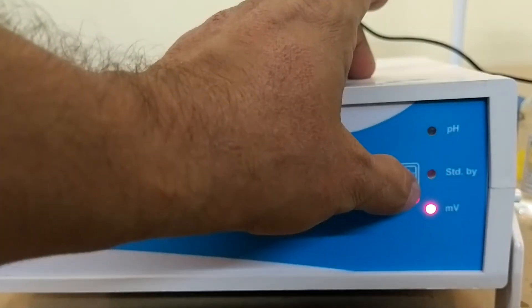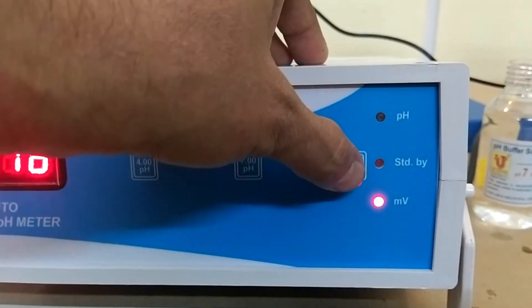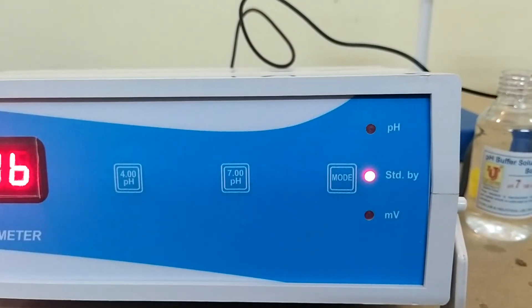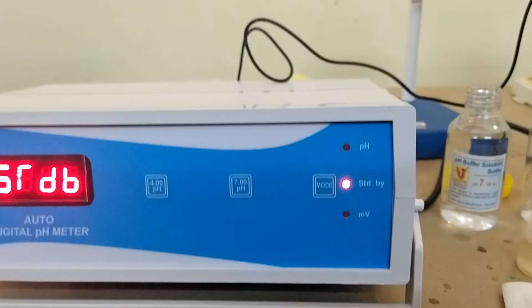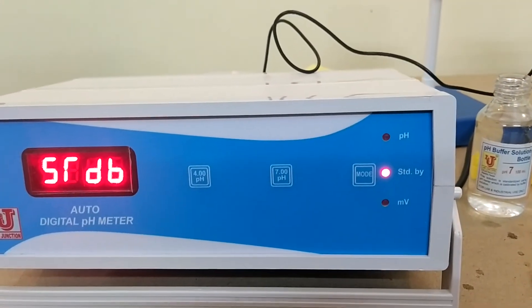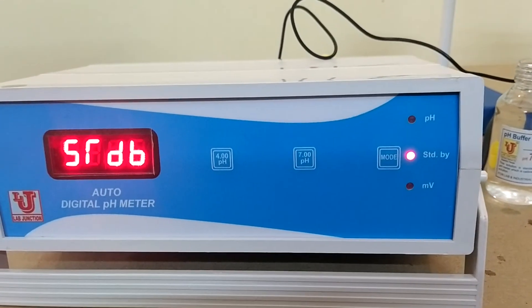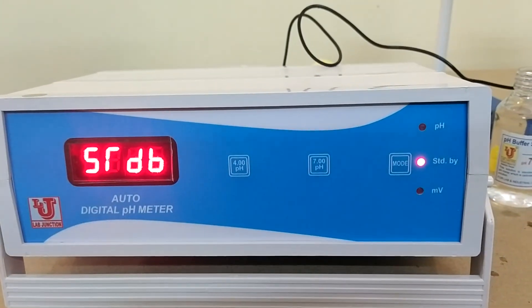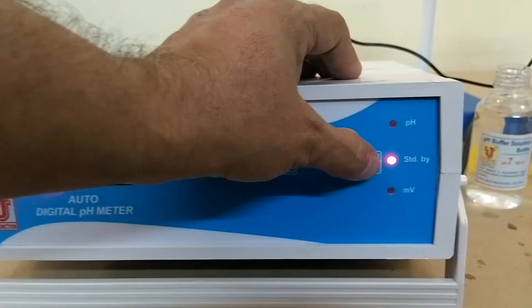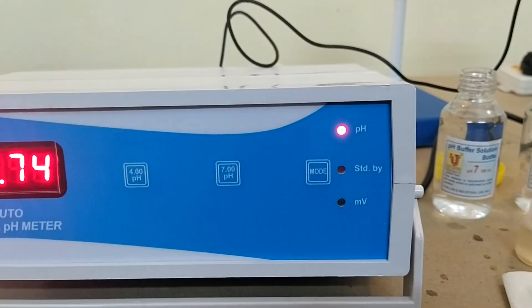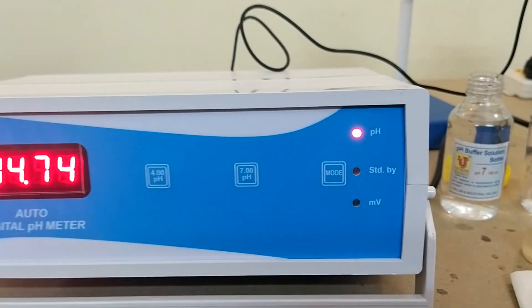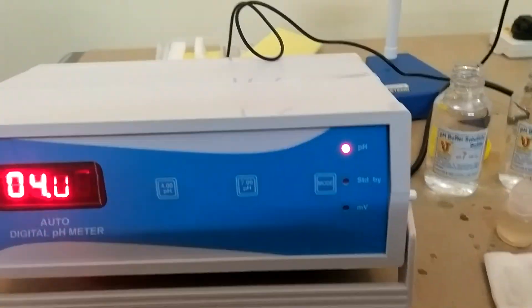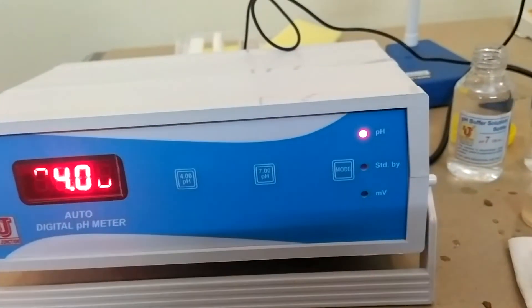Now, if your work is done, then always put the auto digital pH meter on standby mode. When you again take analysis, you can switch on the mode to pH. This is the final demonstration of lab junction auto digital pH meter.